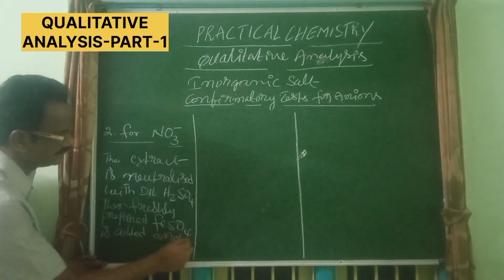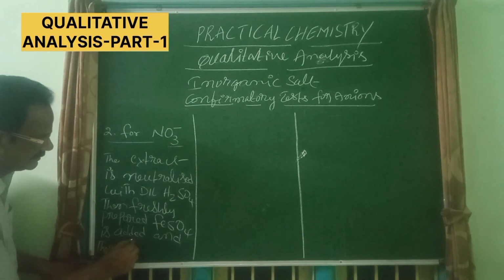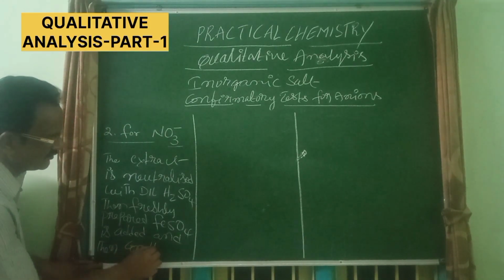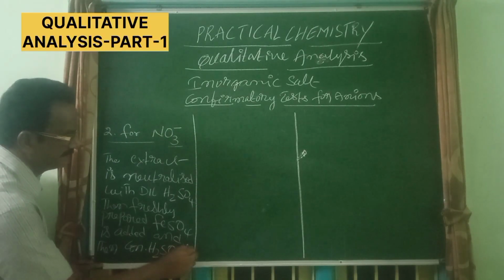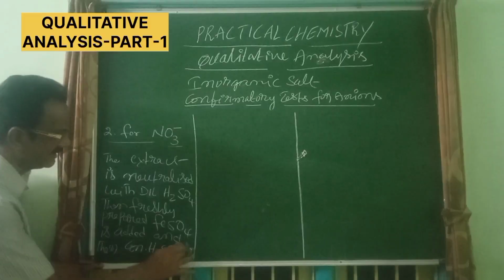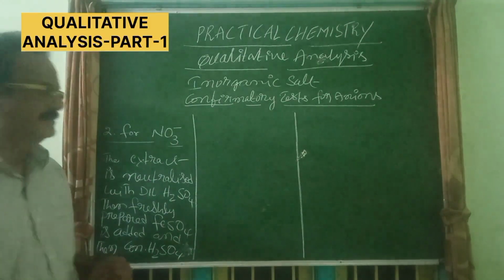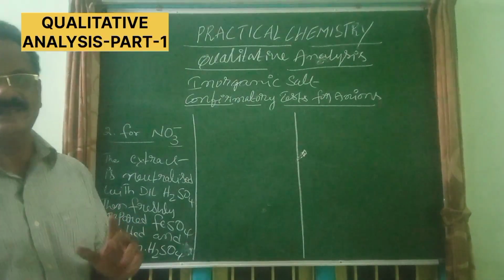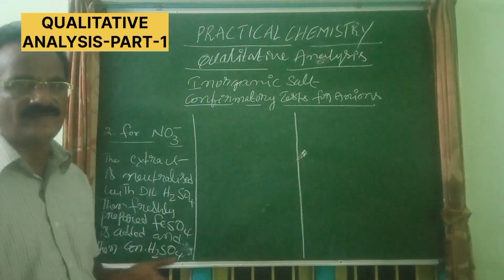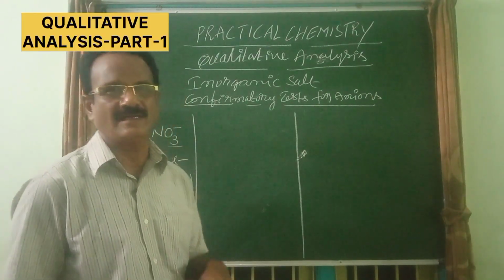And then concentrated H2SO4 is added. Concentrated H2SO4 is added. Is it clear? So here, this is the most important test in inorganic chemistry. Okay, the skill of an analyst can sometimes be gauged by this experiment also.